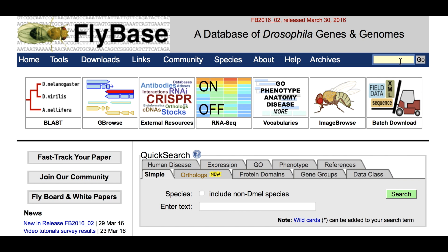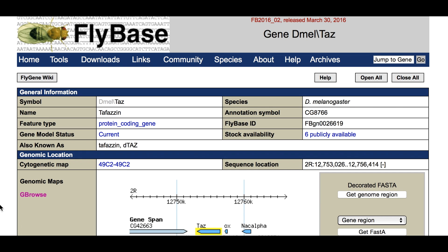Navigate to a GBrowse view by going to the gene page of your favorite gene and clicking on the GBrowse icon in the top left section of the page.